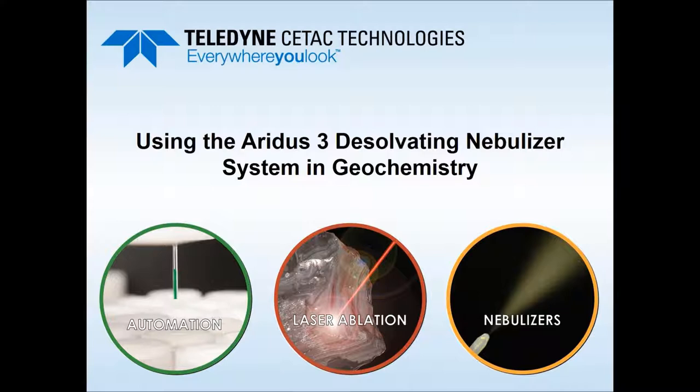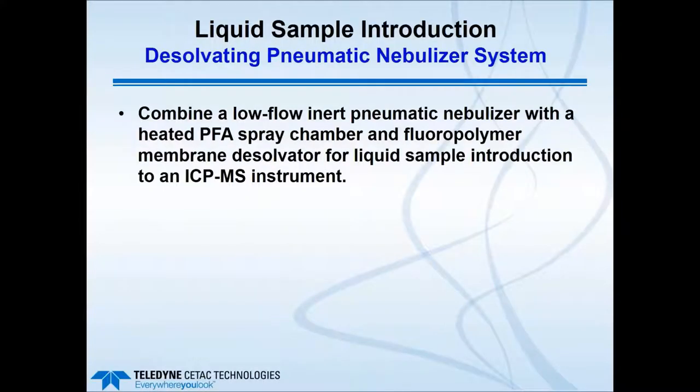Okay, thank you, Shelley. As Shelley indicated, today we're going to talk about one of the Teledyne CETAC accessories, the Aridus3 Desolvating Nebulizer, and we're going to look at the general operation of the system, the setup, and some applications in geochemistry.